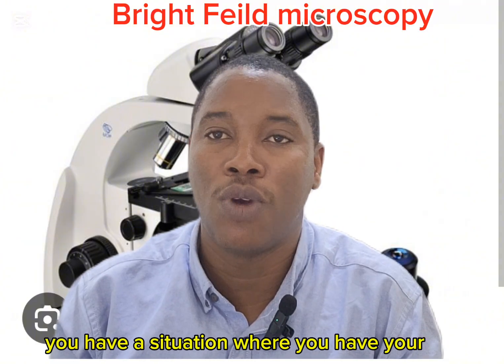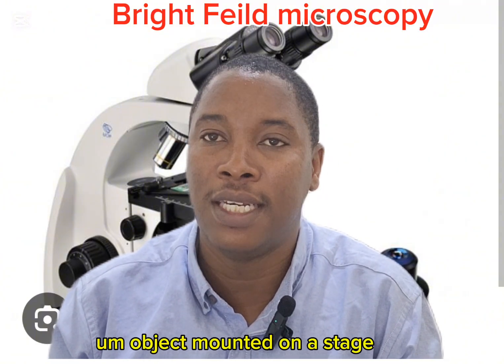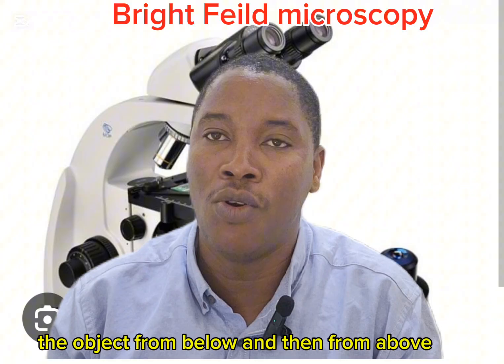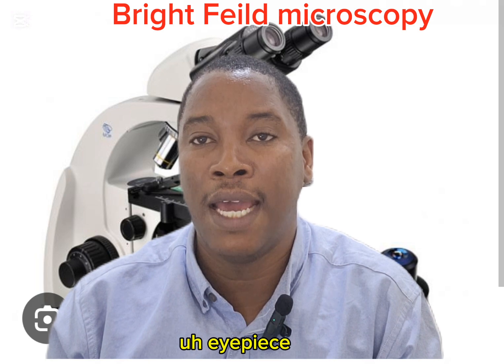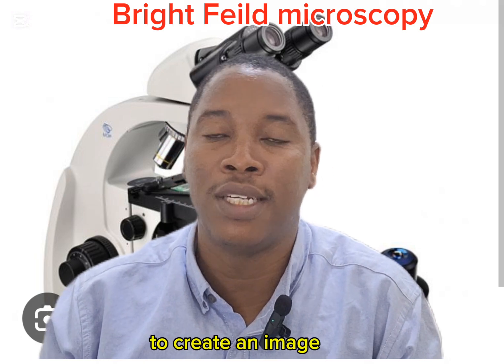You have your object mounted on a stage, and then you have your light source hitting the object from below. And then from above, you as a scientist are viewing through an eyepiece and then through a series of objective lenses to create an image.